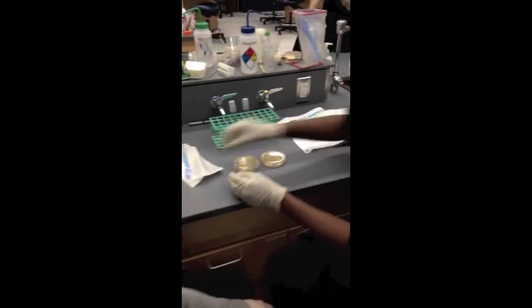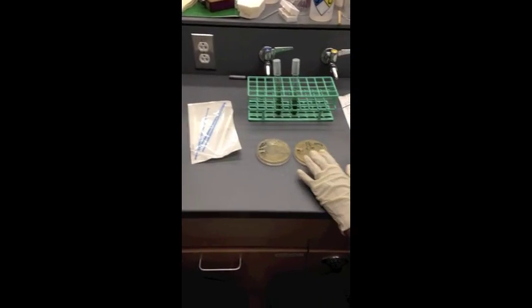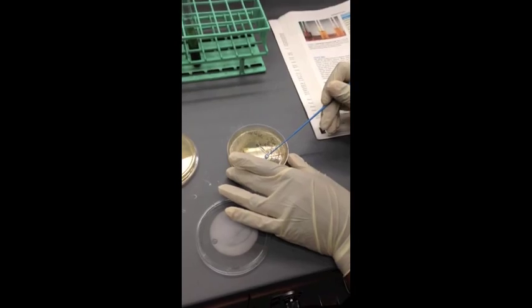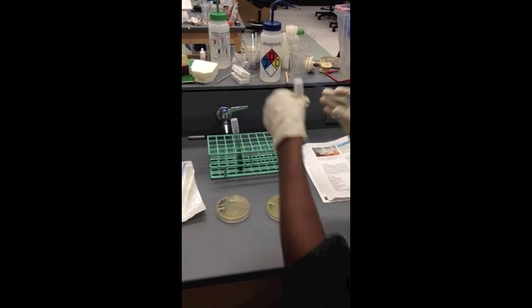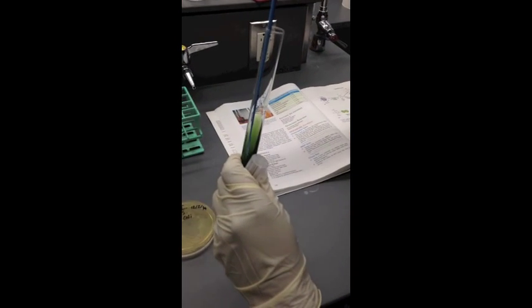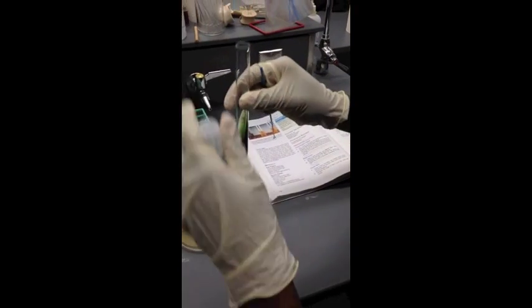First, I'm going to start by taking one sterile loop. I'm going to use the E. coli streak plate first. I'm going to obtain one pure colony. Then I'm going to take the E. coli uninoculated tube and inoculate it by sticking the loop into the tube. Make sure the bacteria is off of it, then close it.